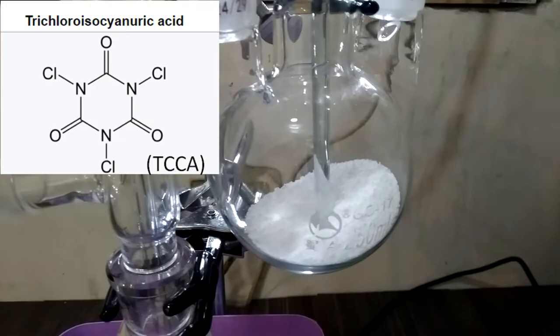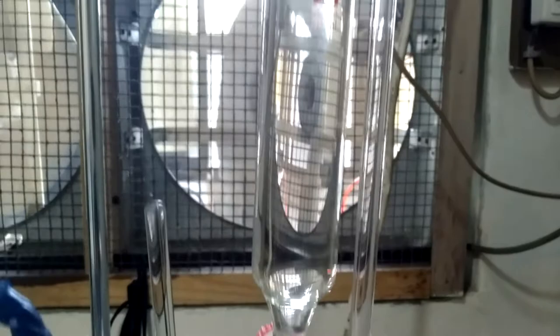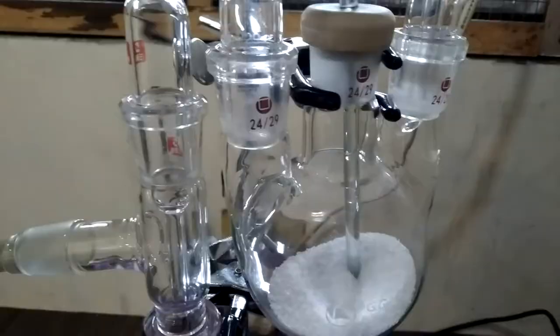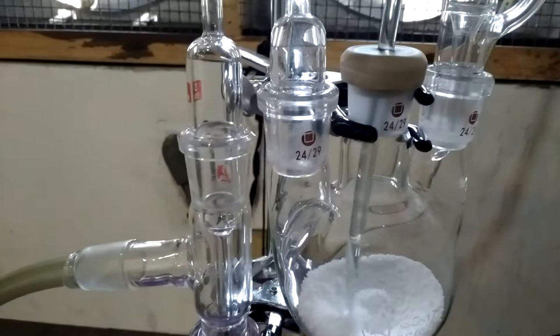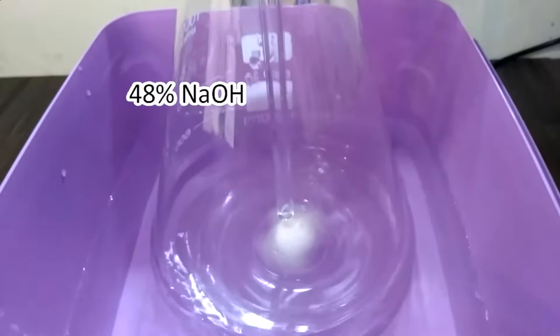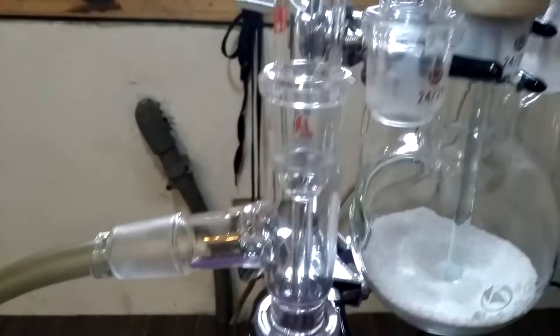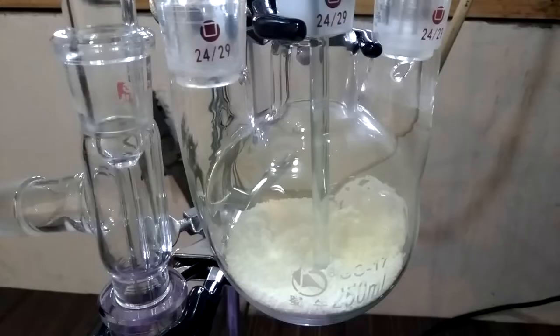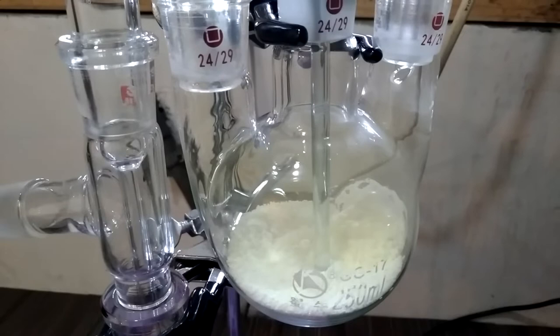Here's the setup. We have a three-neck round bottom flask with some trichloroisocyanuric acid, or TCCA, powder. In the pressure-equalized addition funnel, we have concentrated hydrochloric acid, which reacts with TCCA to produce chlorine. The glass stir rod can stir the mixture during the reaction — make sure all the TCCA powder is reacted. The chlorine gas goes through the pipe and reacts with concentrated sodium hydroxide solution to form our product. The unreacted chlorine gas is quenched by solid sodium hydroxide in a brown bottle.